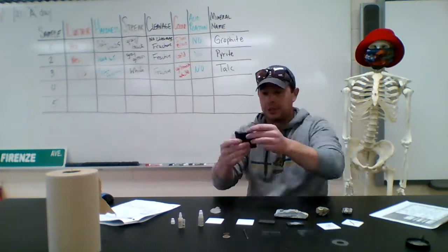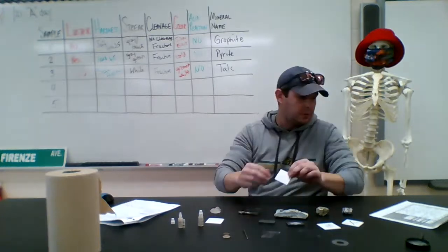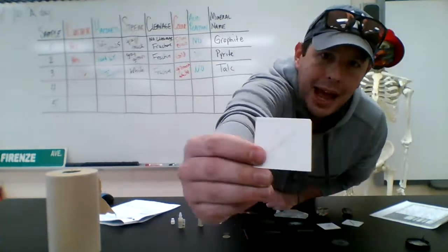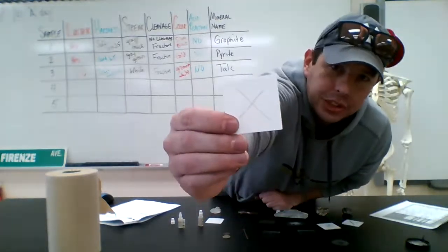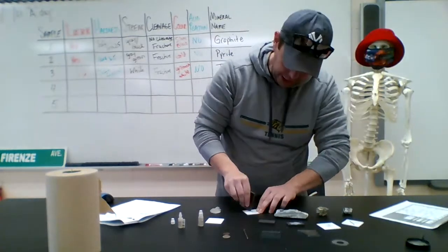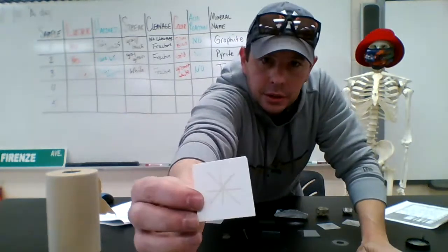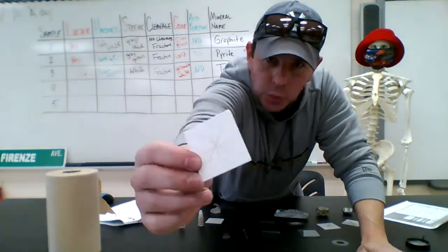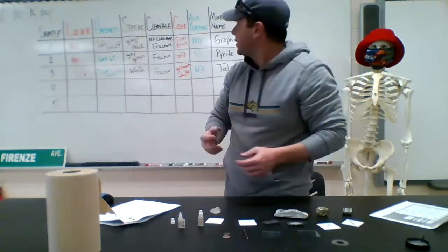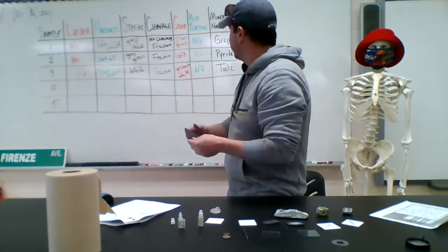Streak. Okay, what color is it? Let's take a look. Ooh. You guys see the color? It's not black. Kind of like a goldish color. So here we go. We've got a black mineral here, but when you streak it, make a streak, it comes out to be a gold color. Interesting. Wouldn't have expected that. This one's unique. It's surprising me. Very cool. Excellent. Next test. Color. Black. Okay, easy.